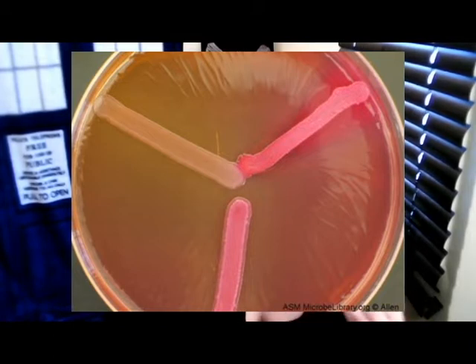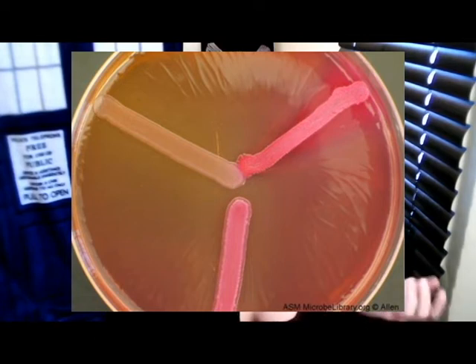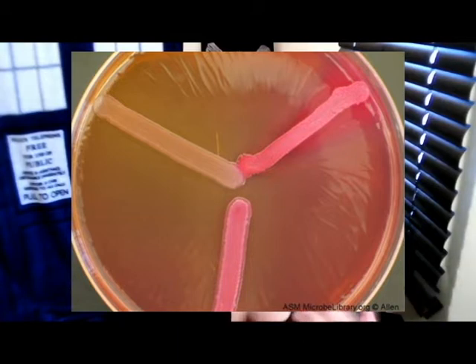So this is an example of a selective and a differential media. This is the MacConkey's agar. It differentiates between the bacteria that can ferment lactose and those that cannot ferment lactose. Unlike the mannitol salt agar, the difference between those that can ferment mannitol and those that cannot ferment mannitol, and it selects for gram-negative bacteria.